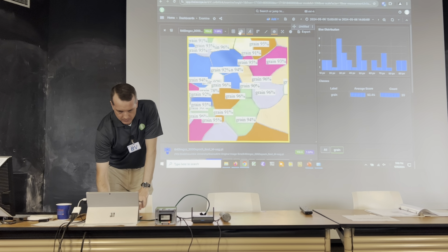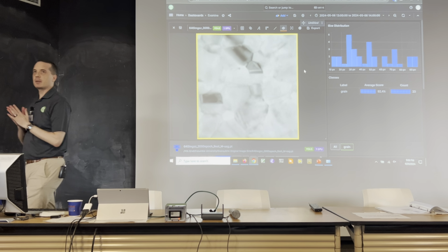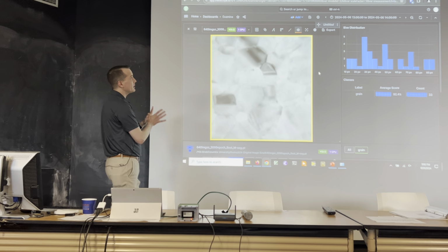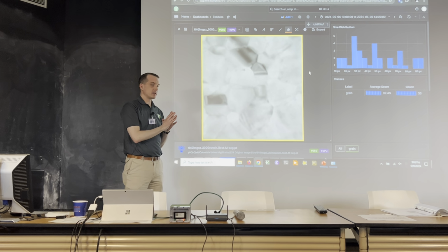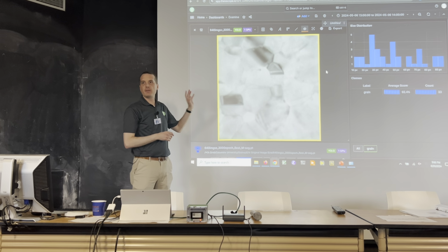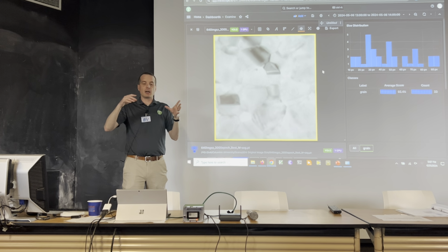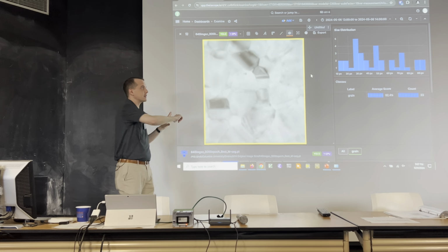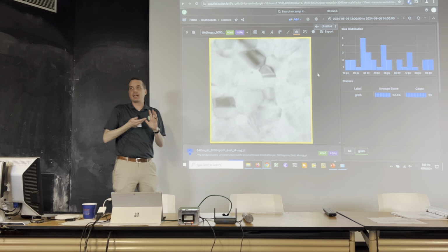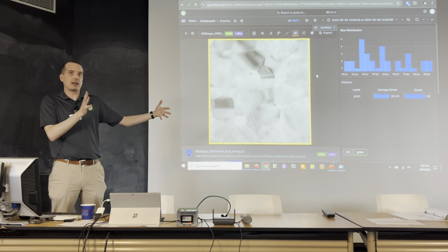This is not black dots. This is something else we've been working with Columbia University on, and that's looking at the grain boundaries. I'm showing this one as an example in the system because they had 30 years of data. They were actually films that they had developed in the late 90s, and they would print them out on transparencies on a projector and draw the boxes around that way, and then scan that back in and use that to do their analysis with. And they had 30 years of that data.